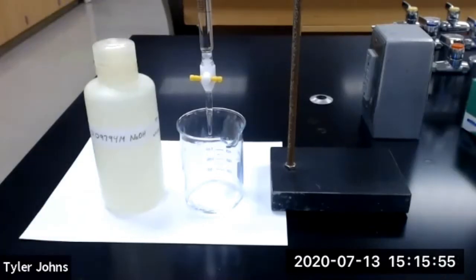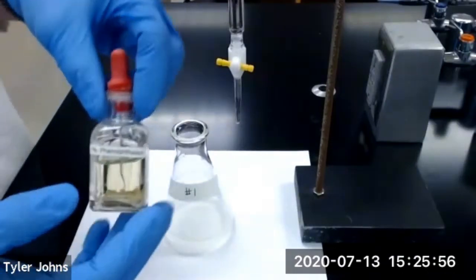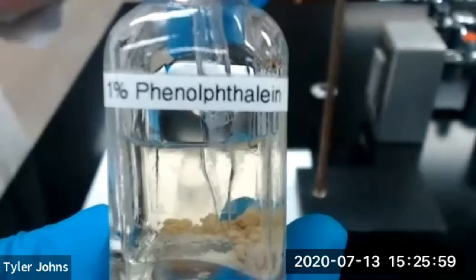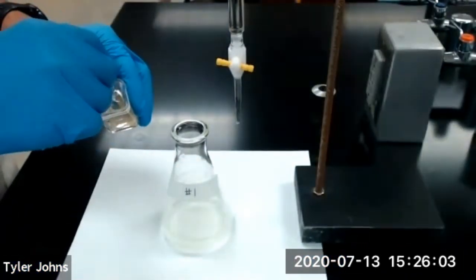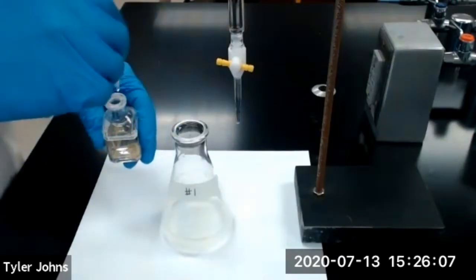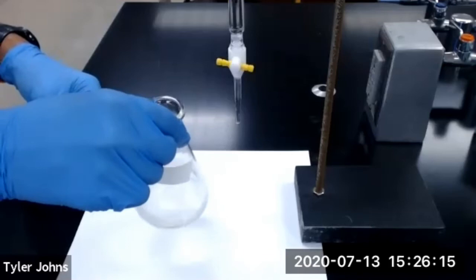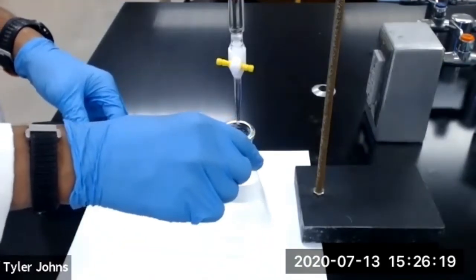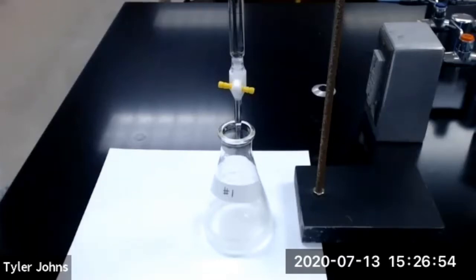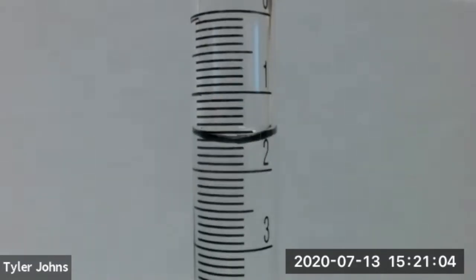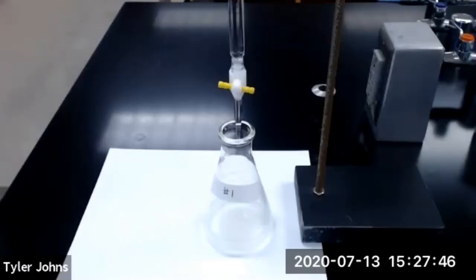If you would like to view how to properly prepare the burette, please refer to one of the previous titration experiment videos. We are next going to add three drops of our 1% phenolphthalein indicator to our flask with the first half of our vitamin C tablet. We'll then swirl our flask and we're now ready to begin titration number one. We will have reached the end point of our titration when a pink color persists for 30 seconds while swirling. This is the initial burette reading for titration number one, and we will now begin titration of the first half of our vitamin C tablet.